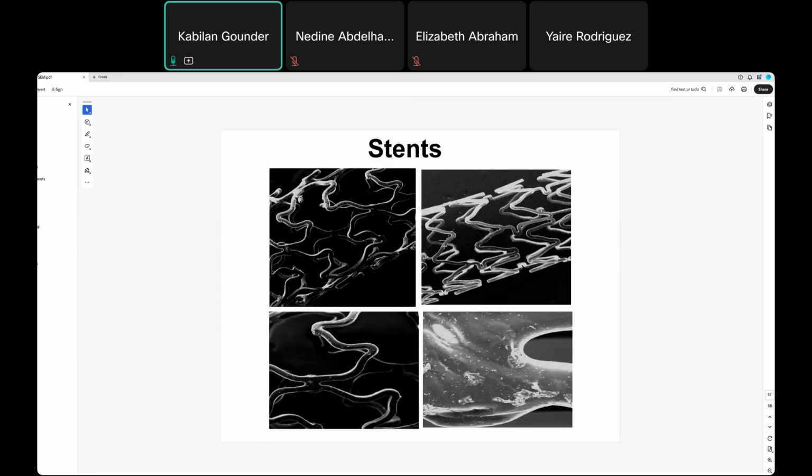So this is a stent commonly used for angiogram or angioplasty to remove a blockage. One cardiology resident wanted to study this, to see how stents from different companies look after they are inserted in the dog. So we wanted to study how, under different pressure, these stents tolerate it when compared to each other. So that is this study.